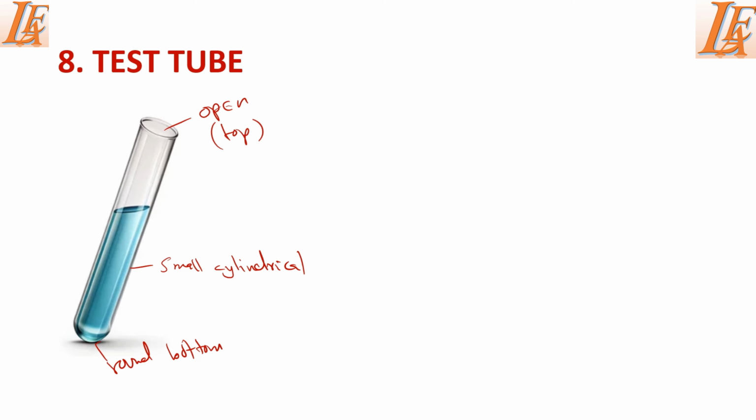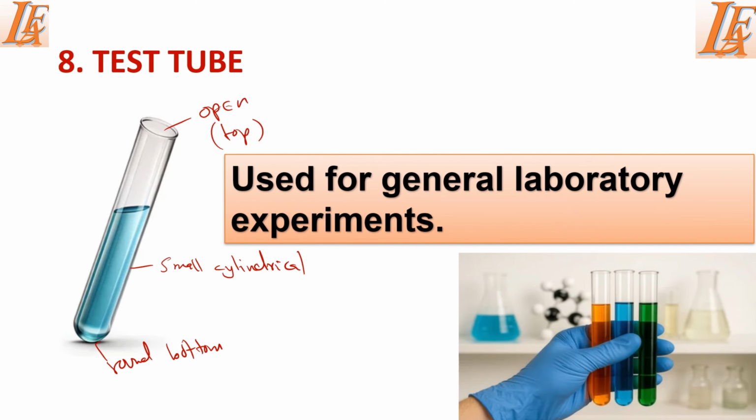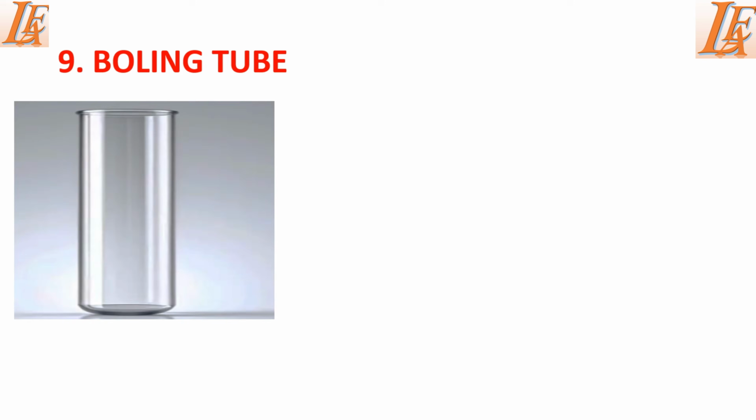And then the function of this test tube is that it's used for general lab experiments like holding, heating, and mixing small amounts of substances during experiments.